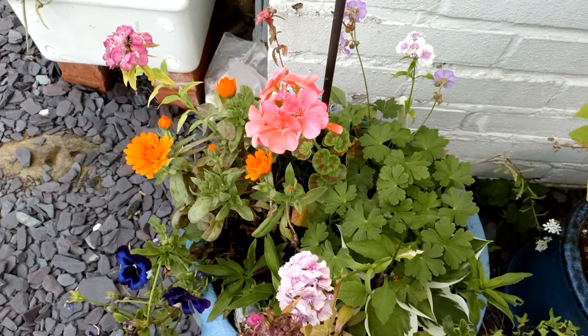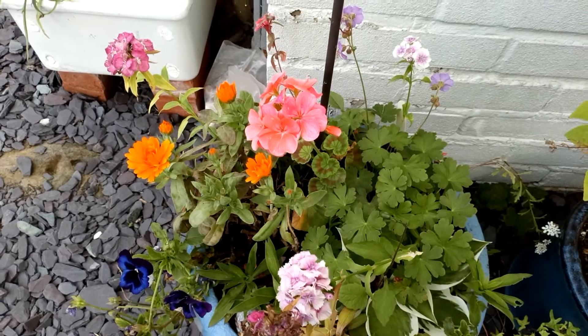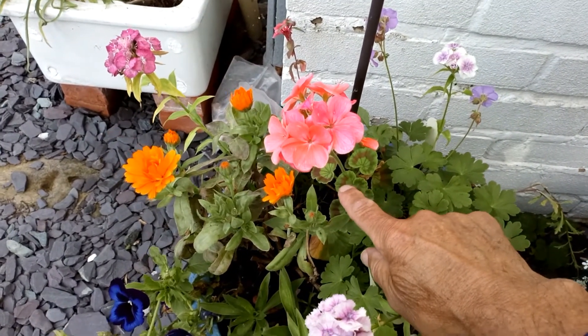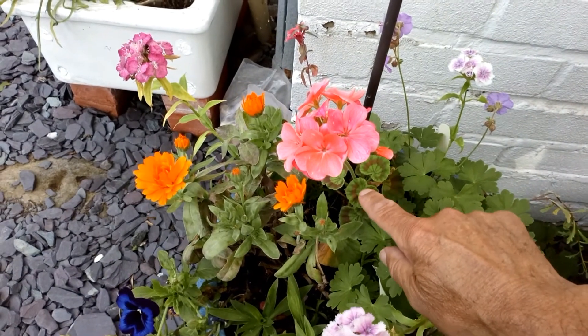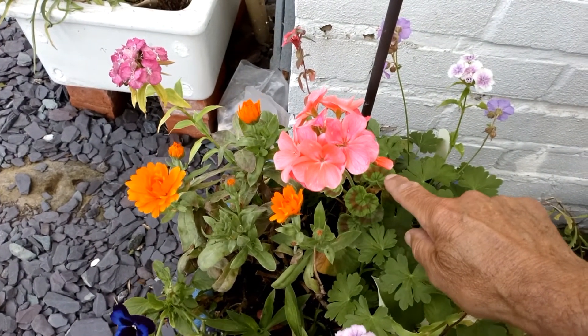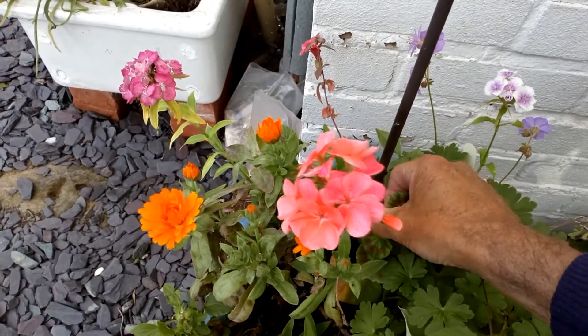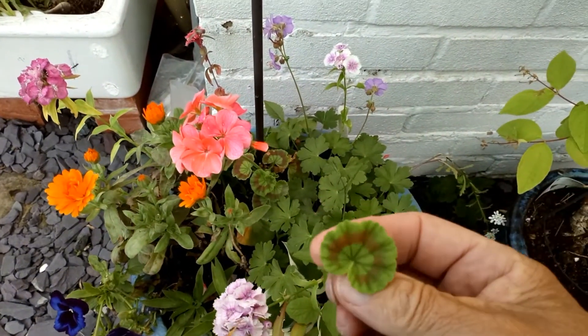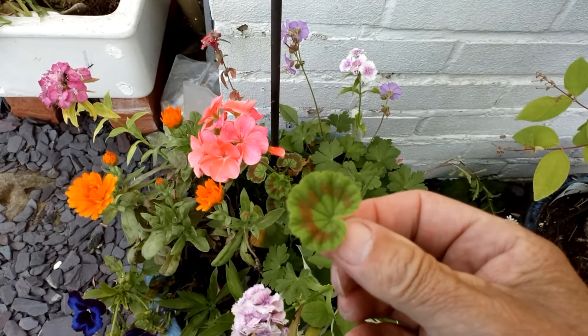Now geraniums are particularly good for this experiment. So here is a geranium in flower and these down here are the leaves. So what I'm going to do is take one leaf from there. And we're going to test this leaf to see whether it contains starch.